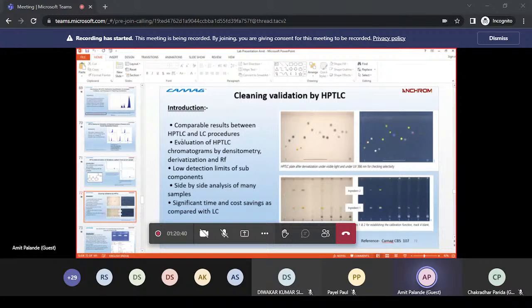on that basis we identify whether it is present in the sample or not. Then identification of the ashwagandha, which is Withania somnifera, by HPTLC. So you can see the discrimination of Withania somnifera root and leaf with withanolide A, beta sitosterol, and Withania somnifera leaf. So it is done and identified by using the HPTLC. Then identification of the kokum, which is Garcinia indica fruits, by HPTLC fingerprint. So garcinol, the main marker component present in the Garcinia indica sample, was detected by using the HPTLC system.